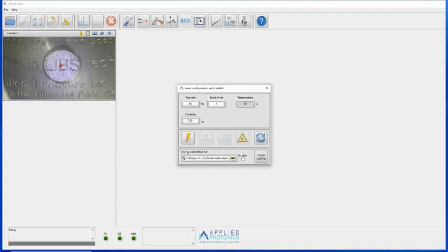The repetition rate will, however, be automatically set to the maximum rate for the laser when firing conditioning shots, in order to minimise the time it takes to fire these shots. The laser repetition rate doesn't affect the acquired spectra, however, depending on the performance of the computer and the type of spectrometer used, acquisition timeouts could occur at higher laser repetition rates. If occasional acquisition timeouts are observed, the first course of action is to reduce the laser repetition rate.